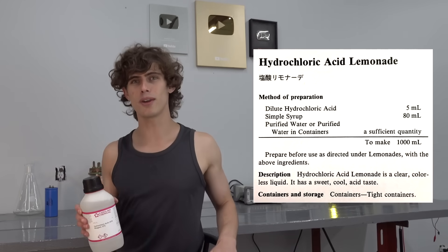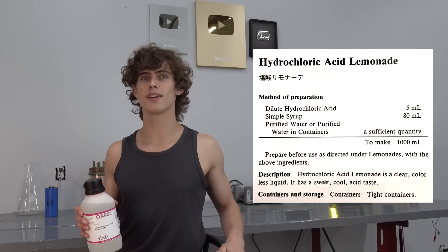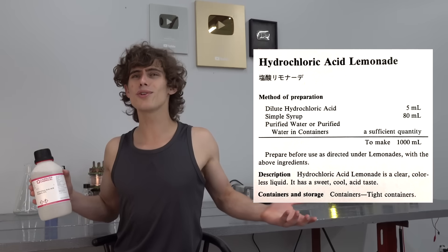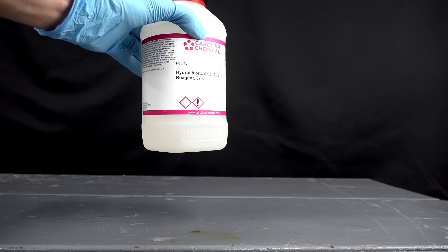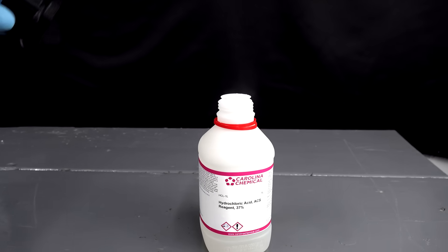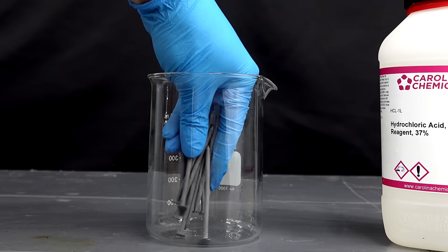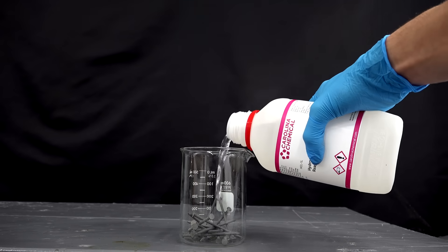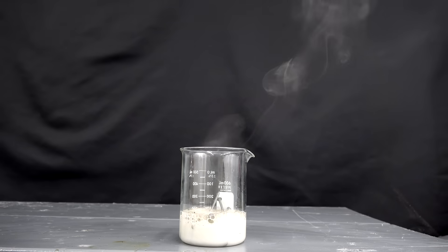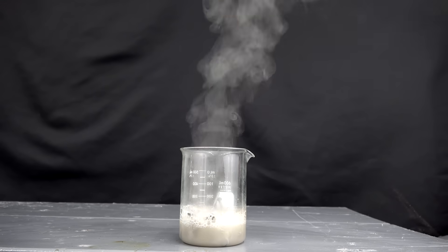Let's take a look at that recipe. Notice how it doesn't actually tell us how much acid to use — it gives a volume, but there's no info on concentration other than 'dilute.' What's dilute even supposed to mean here? How about 37%? That seems pretty dilute, right? It turns out 37% is about as concentrated as you can possibly get at room temperature and pressure for aqueous solutions. That means I'll have to dilute it, but by how much exactly? This calls for a little math.